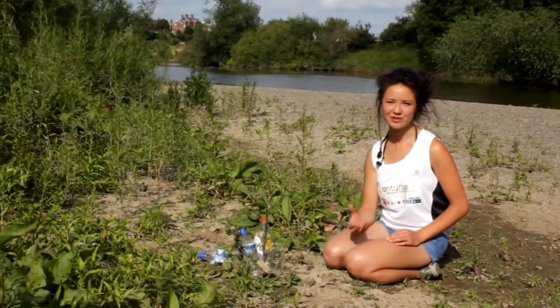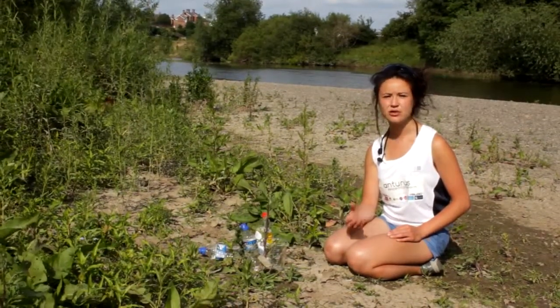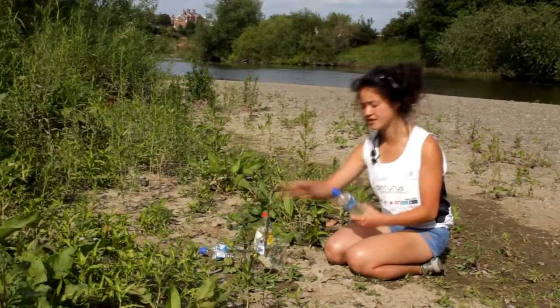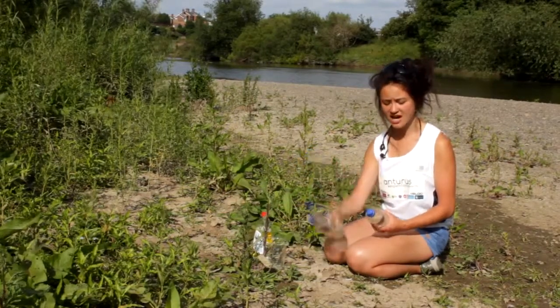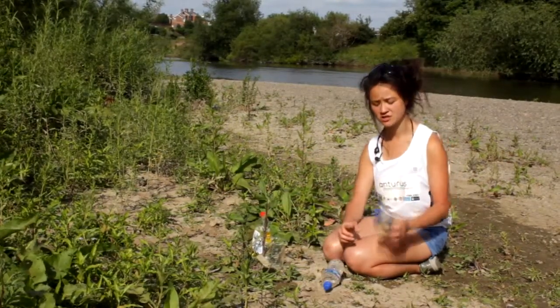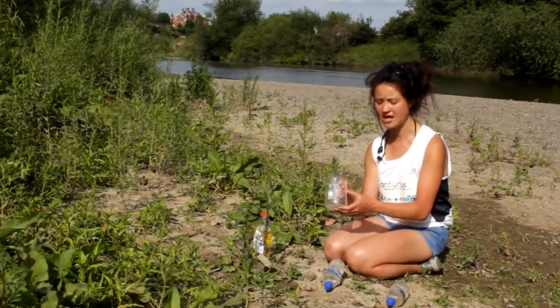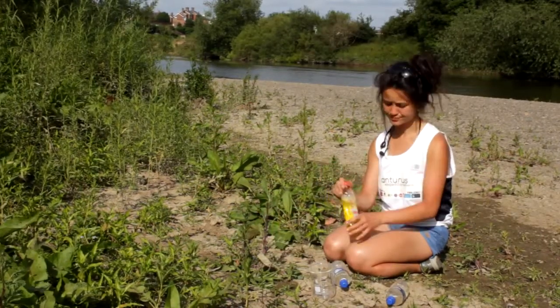So in this experiment, we're going to be testing water which you've collected for its hardness. So all you really need is some water. It can be collected in anything. So I've got some bottles here. I've collected some from 30 miles from the source and some from 60 miles of the source. You also need a couple of these beakers, depending on how many samples you have, and some soap as well.